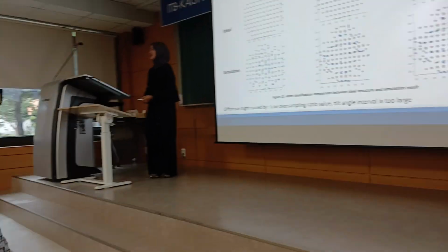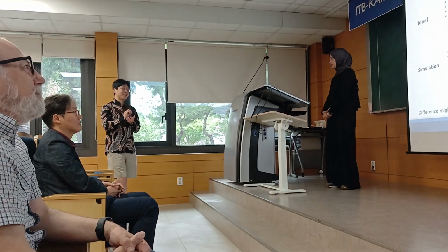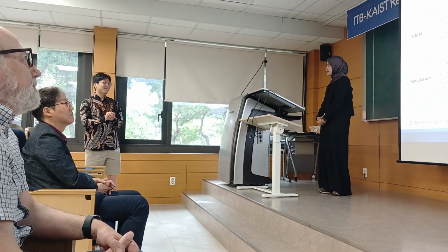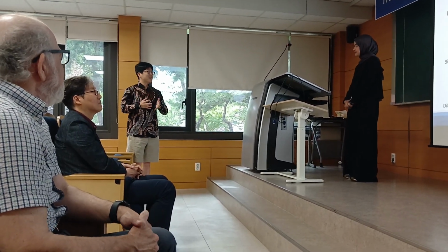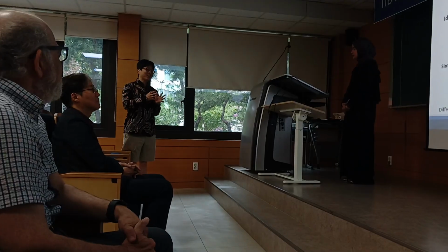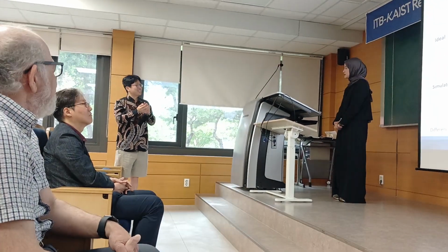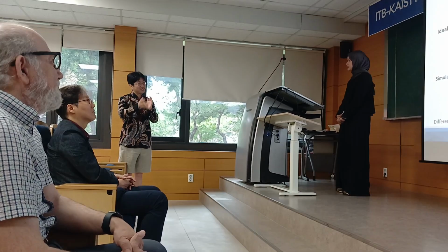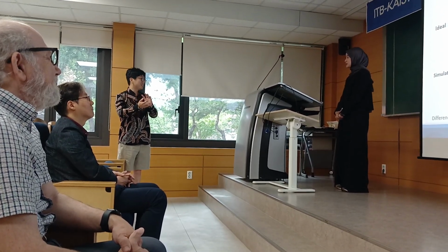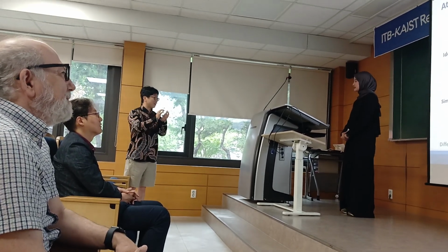I have a quick question. You examine crystalline nanoparticles, right? And then you observe the misalignment based on the measured image. If you have amorphous nanoparticles, can you still use a similar method to adjust the misalignment?